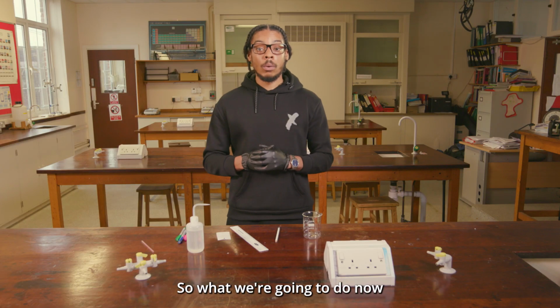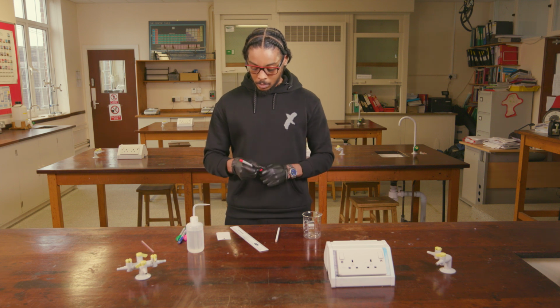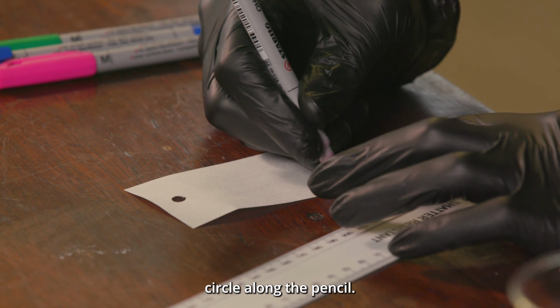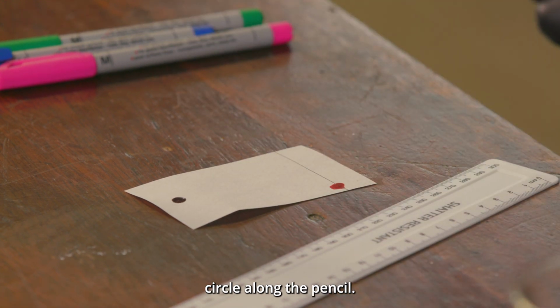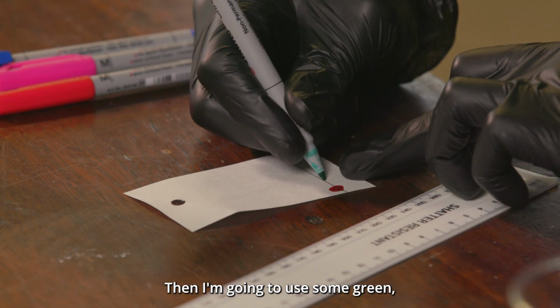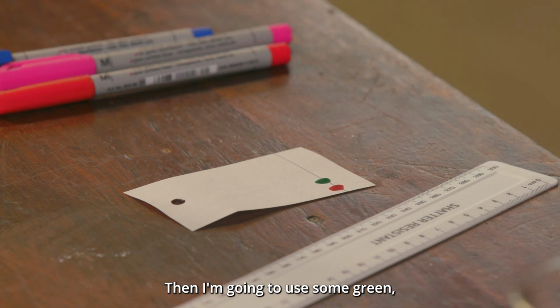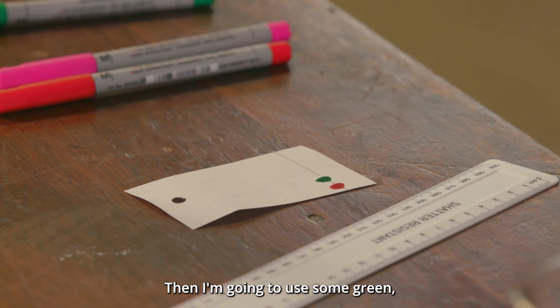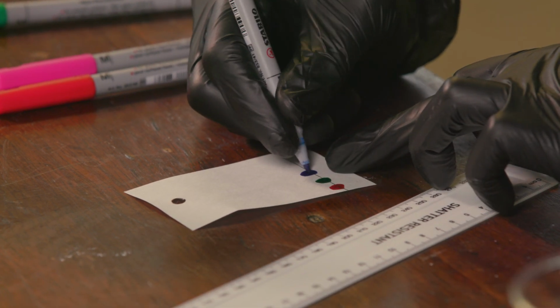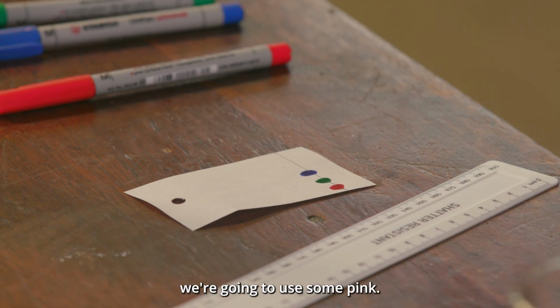Right, so what we're going to do now is put some different coloured ink along the pencil line. So I'm going to start with some red ink. I'm just going to draw a circle along the pencil. Then I'm going to use some green. Then I'm going to put some blue ink. And lastly, we're going to use some pink.